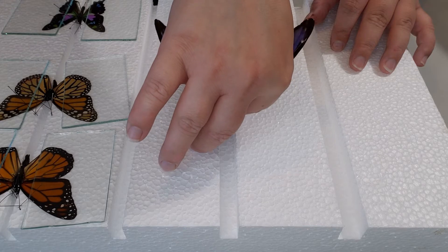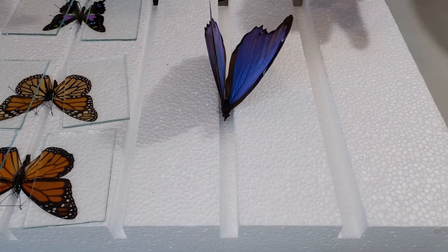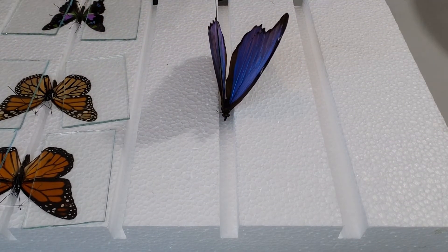Once you get the pin right through the center of the upper abdomen straight through, you can go ahead and place it on your pinning board and put it in the groove designated for it.